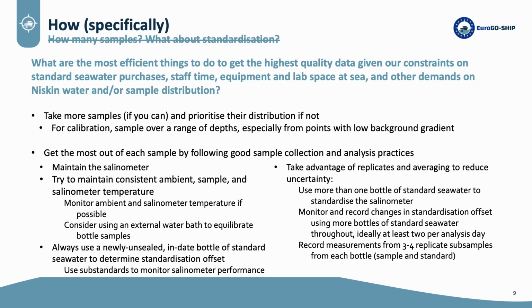When you're measuring the standardization of the salinometer, always use an in-date bottle of standard seawater that you've just taken the seal off of. So don't remeasure one that you've used a few samples ago, an hour ago, even if you put the cap back on, because it will have changed and that will throw off your samples. You can use open bottles or specially made substandards to monitor the salinometer performance, though.